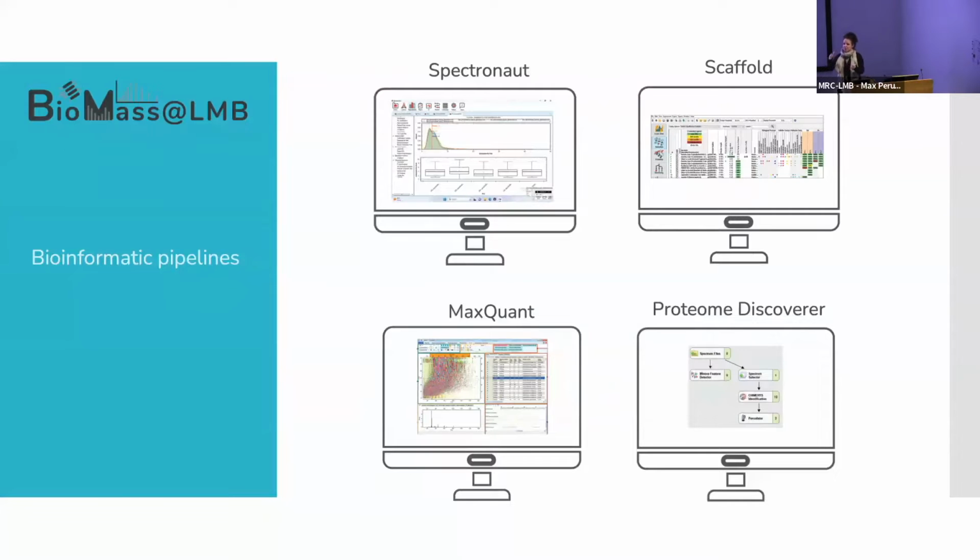I know that there's a transition phase in which everything looks very different and very difficult, but it would be easier, because we don't support you with bioinformatic analysis. Let's say we don't have a bioinformatician in-house yet. That's about to change. It would be very difficult for you if I sent you data in very different formats, because each software is ideal for a specific type of application.